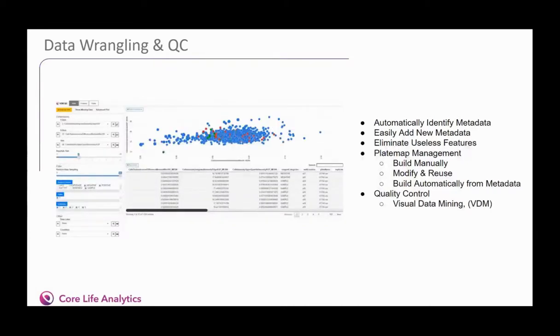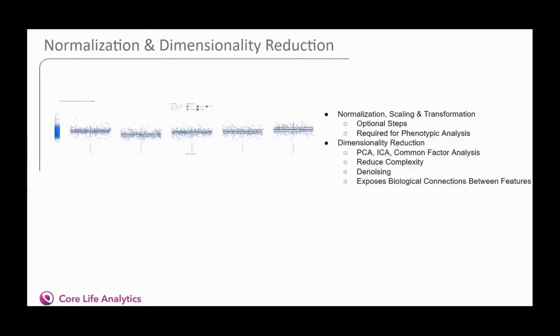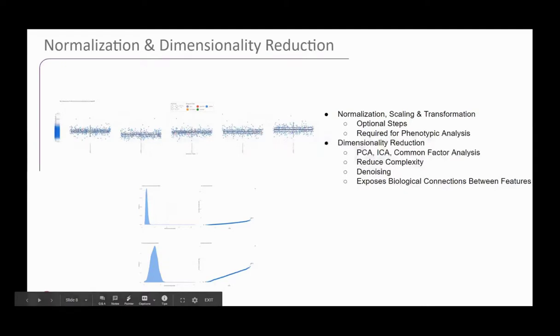We then give you an opportunity to carry out quality control on your data, with access to highly interactive plotting technology called visual data mining — a great place to identify and diagnose problems with your experiment. You can calculate plate metrics such as Z-prime and remove outlier wells. All of this data wrangling and QC actually takes the most time in data analytics, but with Strataminer you can do it in just a few minutes. We then carry out plate normalization against your control wells of choice, and help you transform the data to account for heavily skewed measurements, and scale using a Z-score or robust Z-score.